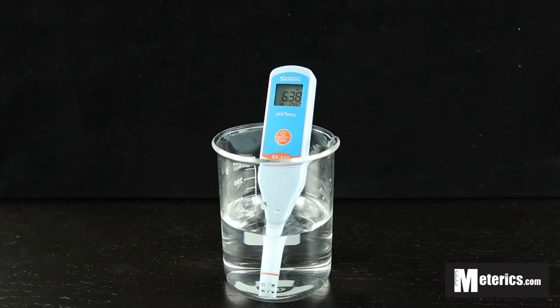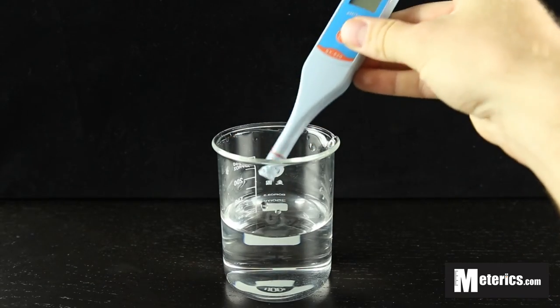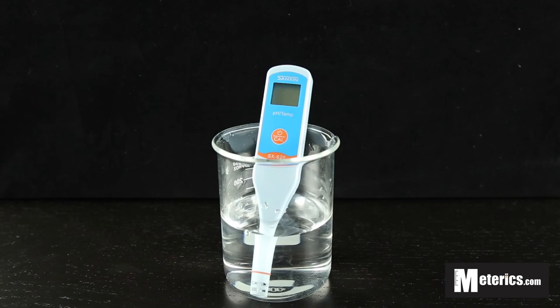Once you record your readings, if that's all you're going to be measuring, you simply turn off the meter with the same on and off button, and then rinse your probe in distilled water, and that's it. Thank you guys very much.